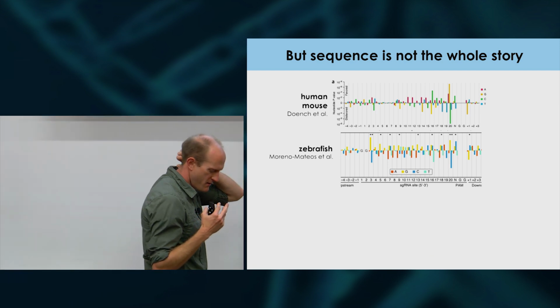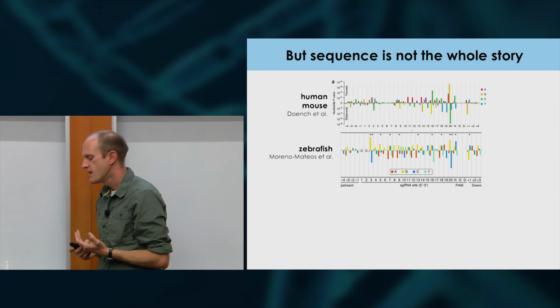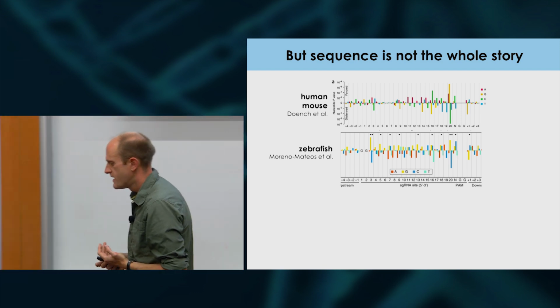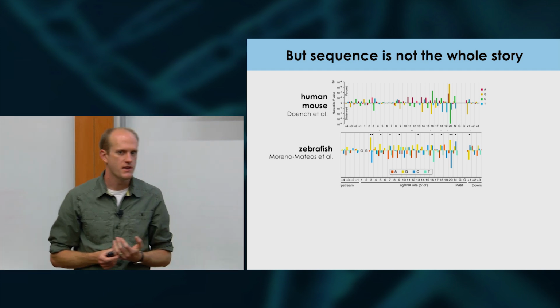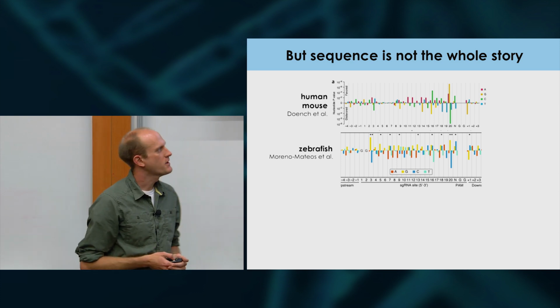based on this whole idea of one true sequence, you might think that Cas9 has certain sequence preferences. But in our lab, we certainly think that Cas9 is going to prefer certain sequences, perhaps, say, right next to the PAM. But we don't think that this is the whole story, and this is why.